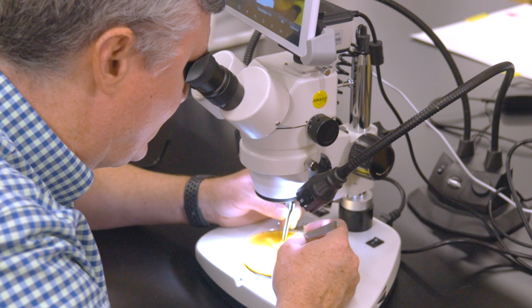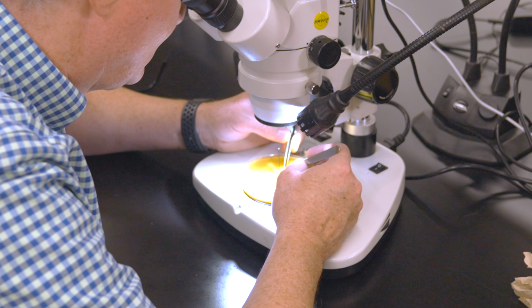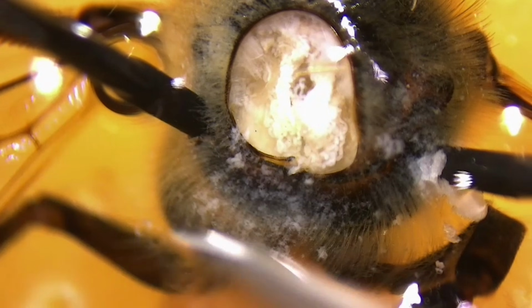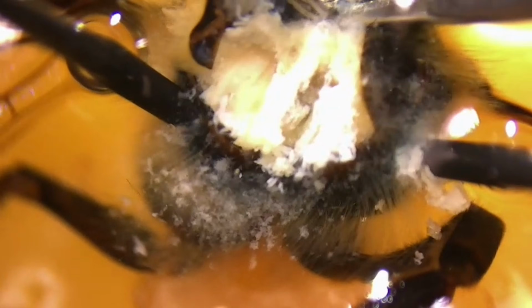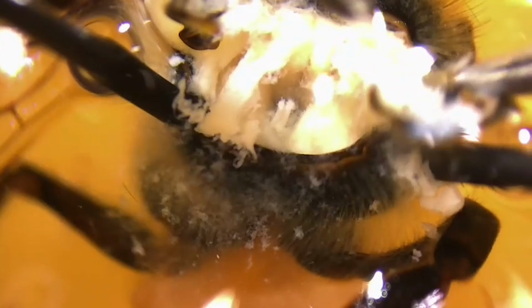And what that does is it opens the thorax for greater visibility. Now, this ring of exoskeleton actually covers the spiracles that lead to the biggest tracheal system in the thorax. So you have to be sure to remove that exoskeleton from the side of the thorax. This is incredibly important because at low tracheal mite infestations, the mites will only be at those openings, at those spiracles on either side of the thorax. So if you're only looking at the tracheal system in the center of the thorax, you might miss mites that have just invaded the tip, the spiracles. So you want to remove that ring, remove that collar all the way down to the spiracle.